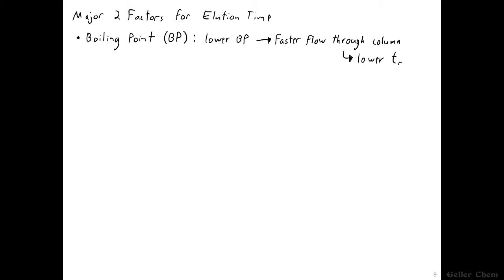A general rule of thumb is that a smaller compound will have lower van der Waals forces, which is a term you might remember from general chemistry. We won't go into it, but the bottom line is smaller compounds tend to have less of these van der Waals forces, causing molecules to be attracted to one another, and thus it's easier to vaporize them into a gas.